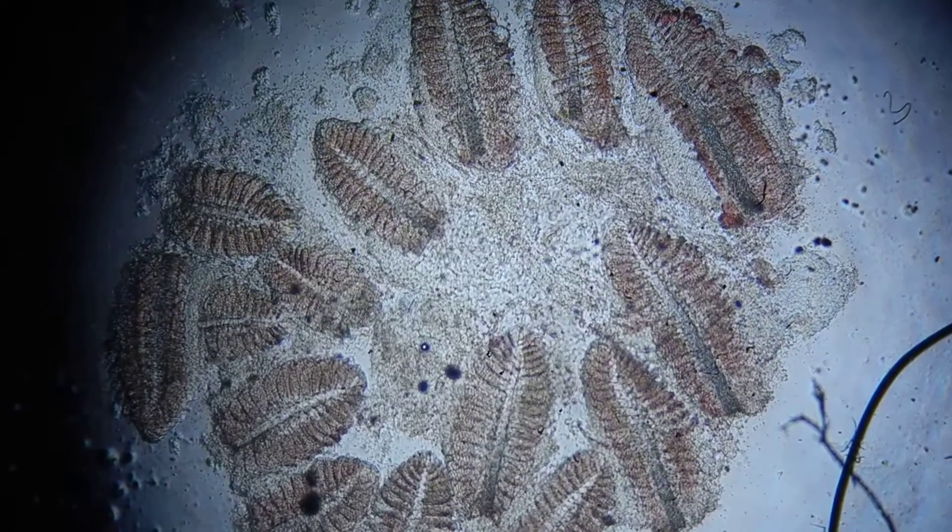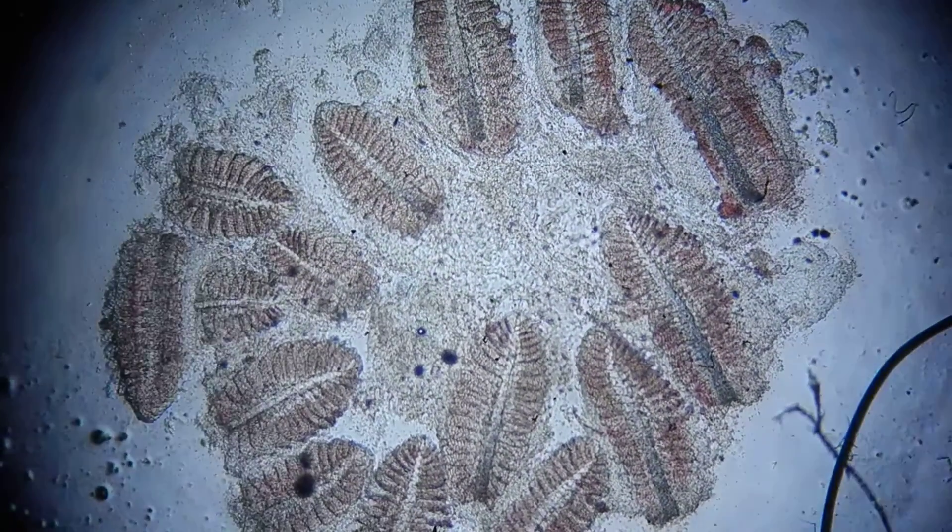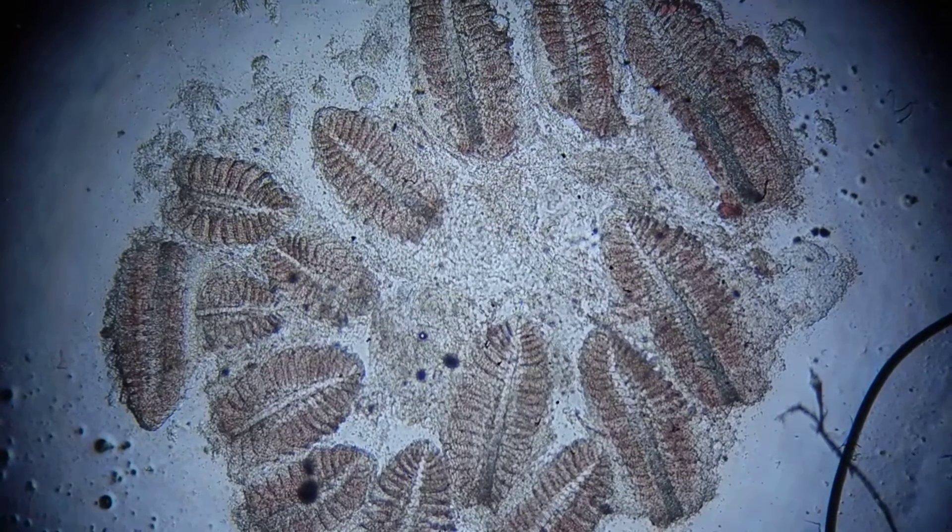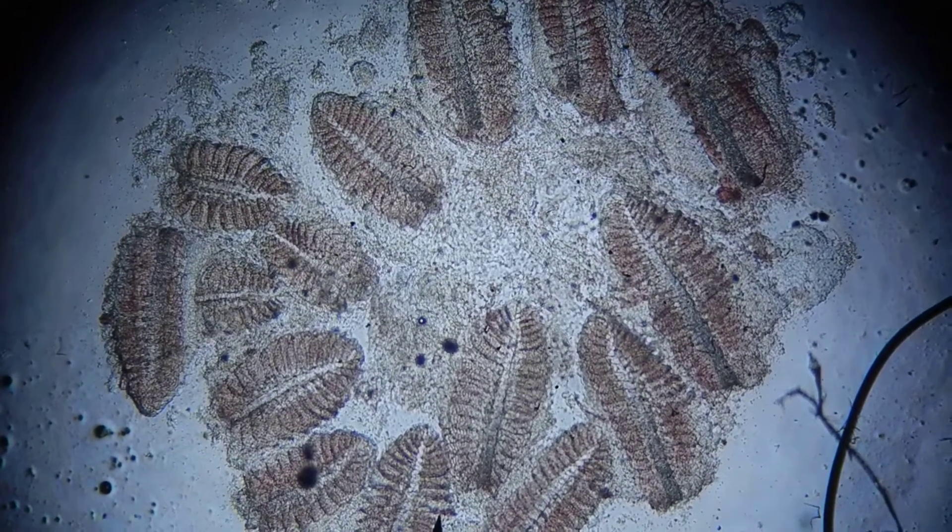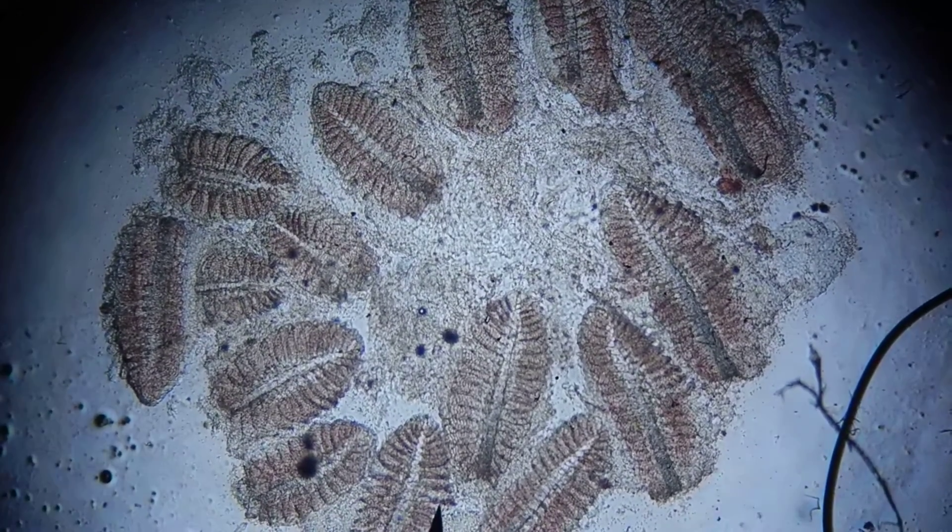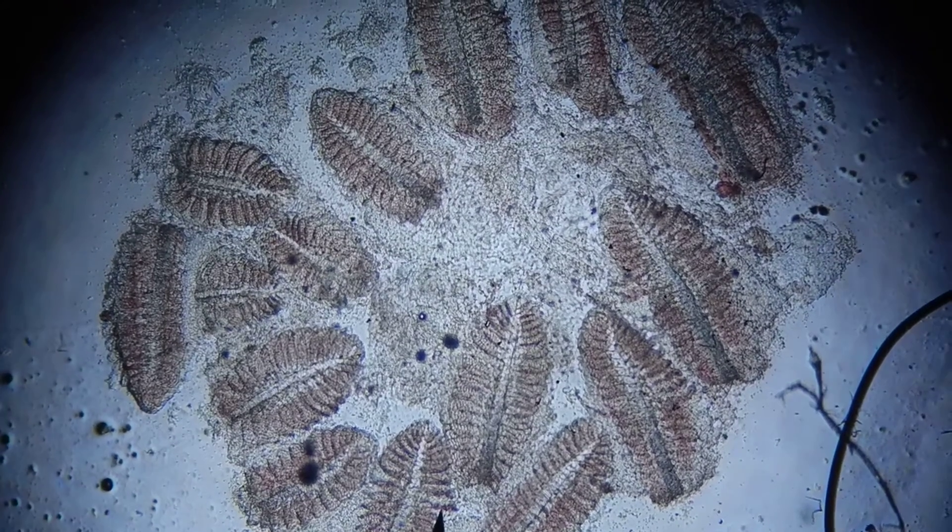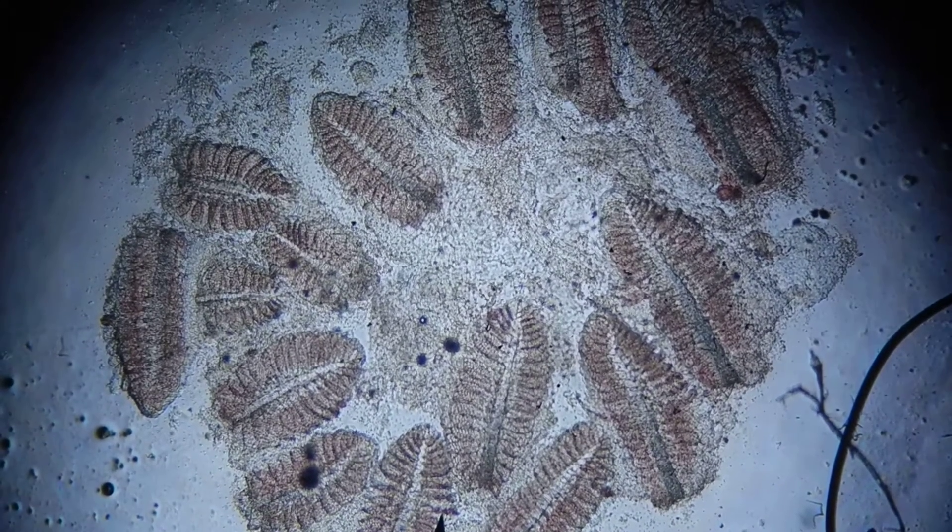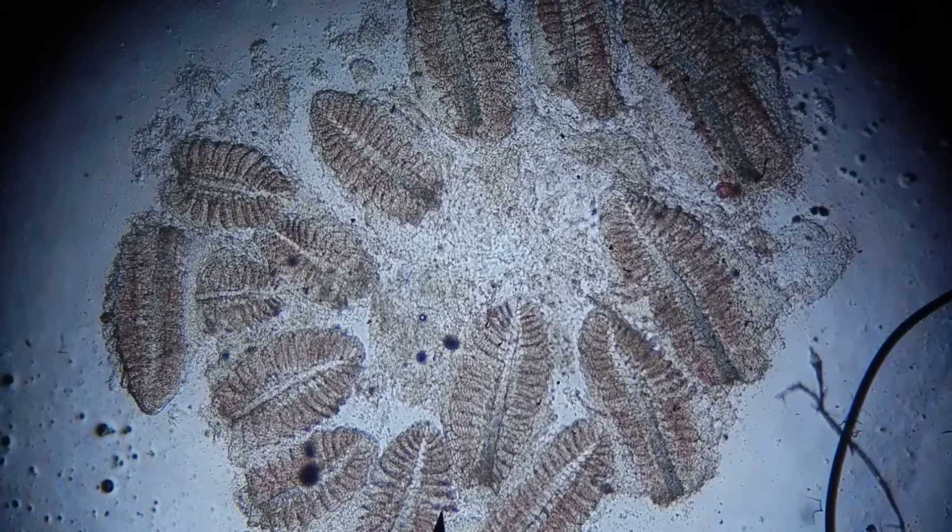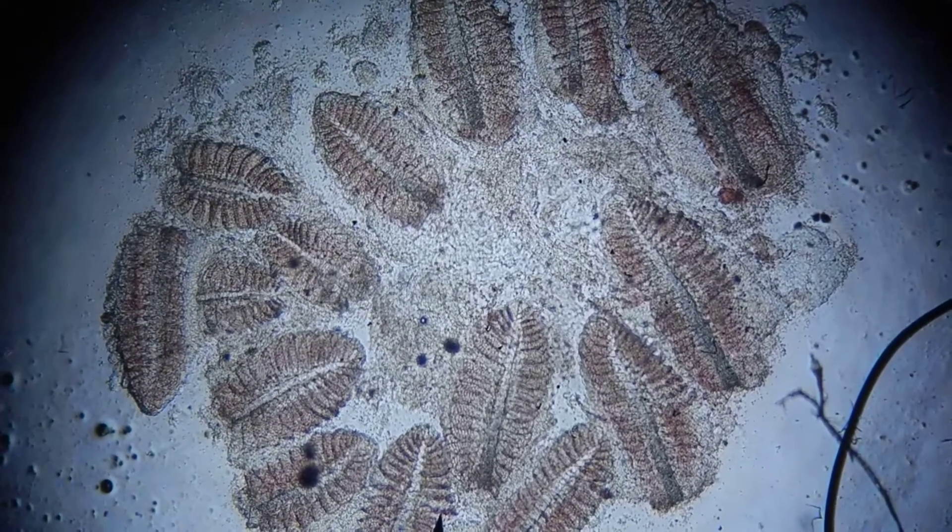Okay, so here what I'd like to show you is a gill biopsy and skin scrape from a normal healthy goldfish. I guess often we're showing pathological conditions without showing you what normal looks like, and so it's hard to tell when there's some change that's occurring.